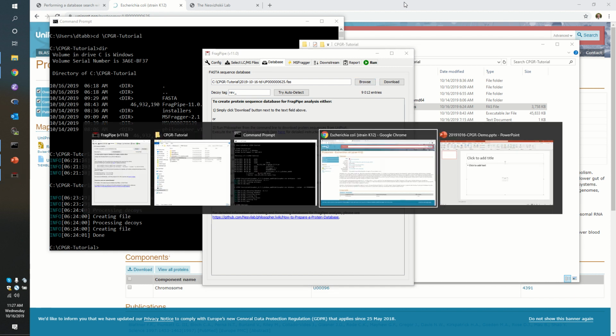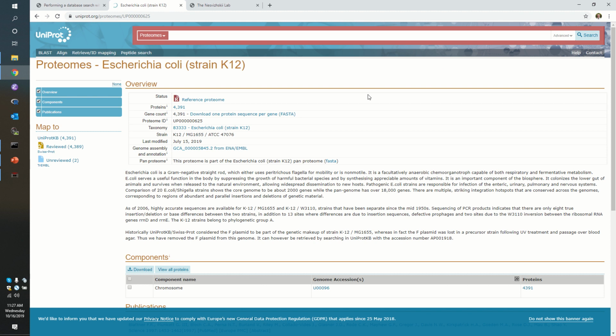All right, I'm going to pop back over to E. coli. What do you see? She's too high. There are, in fact, about 4,400 proteins in E. coli. If you look at something more complex, like the eukaryotic yeast, that's about 6,200 genes. And humans probably get by on something like 70 to 100,000, but that's allowing for a lot of isoforms, transcript differences, stuff like that. We only have about 20,000 coding genes in humans, protein coding genes.